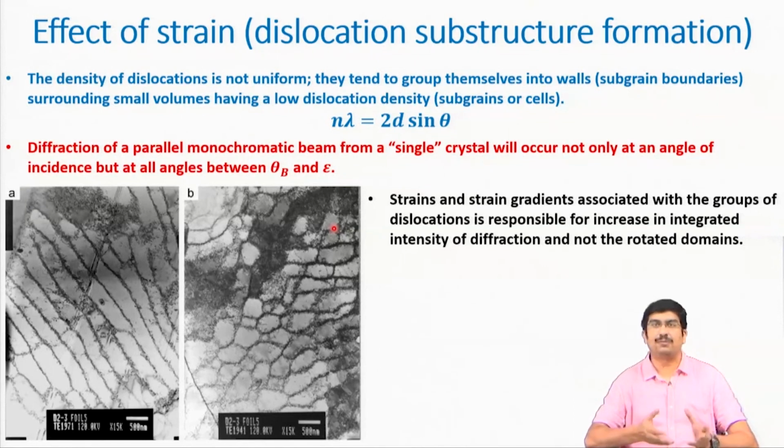So, if you have a non-monochromatic beam anyway, it will be allowing a little more Bragg's condition to be satisfied for a much relaxed condition, and that relaxation increases even with eta as well. So, ultimately what it does is that it will cause these line profiles to be of finite width just because of these dislocation cells being there.